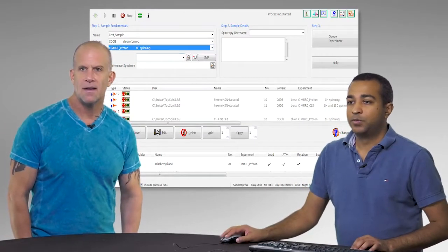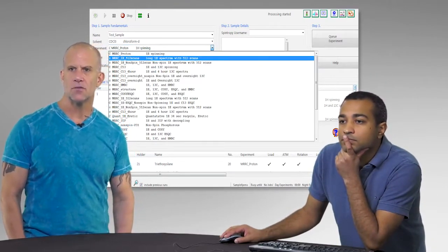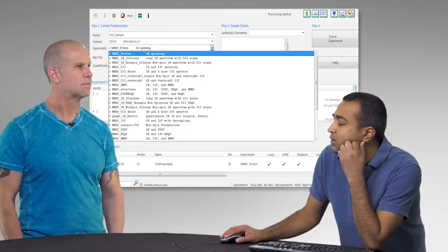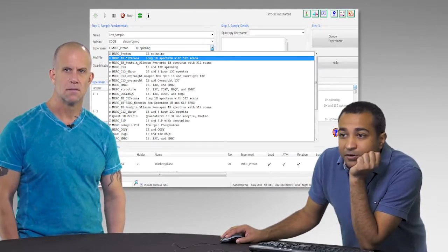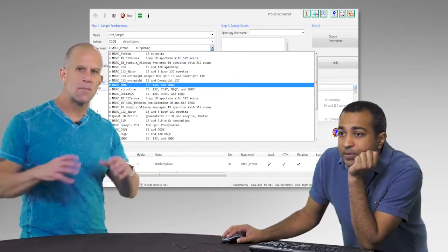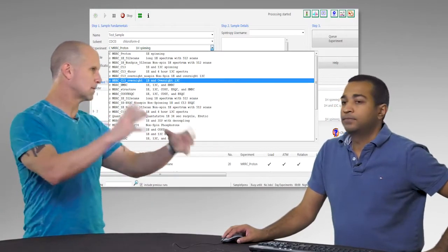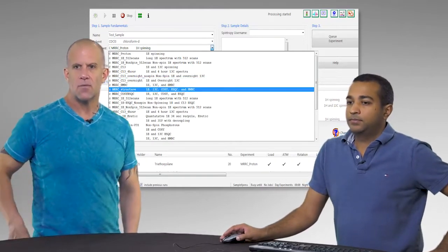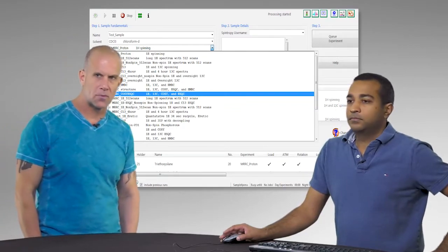And if you want to run a long proton, it even gives you one. The simple one runs about 16 or 32 scans. If you need better sensitivity, you can run the long one with 512. But these are meant for the standard spectral width and standard number of scans run in a proton. It gives you quite a range of either single experiments or multiple ones.